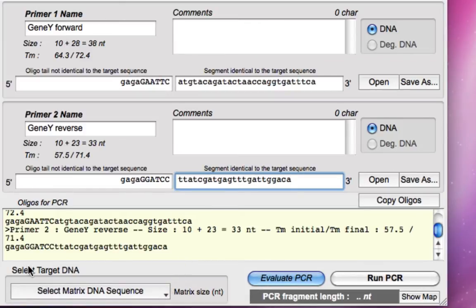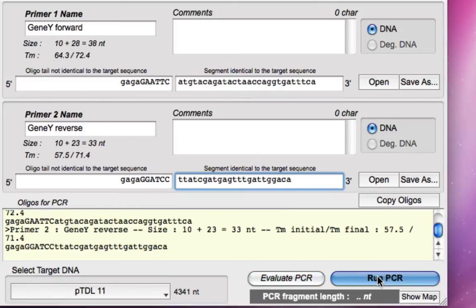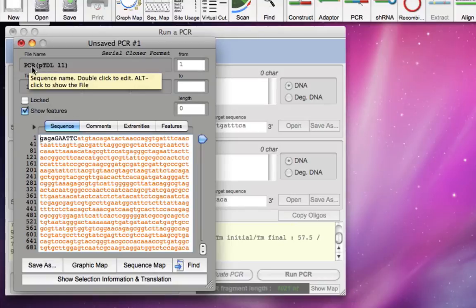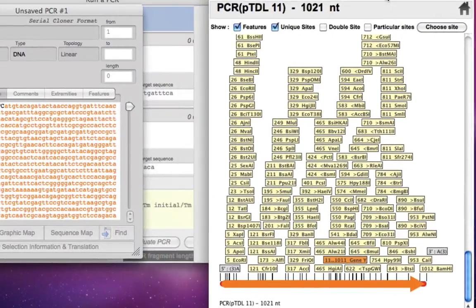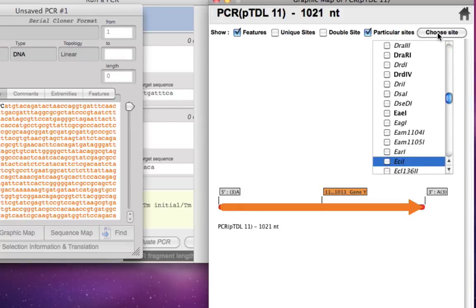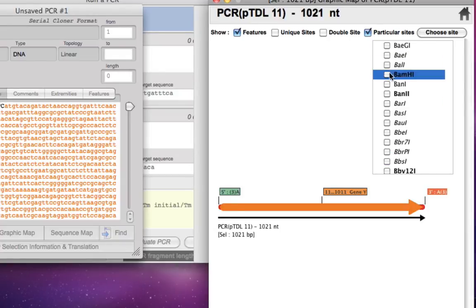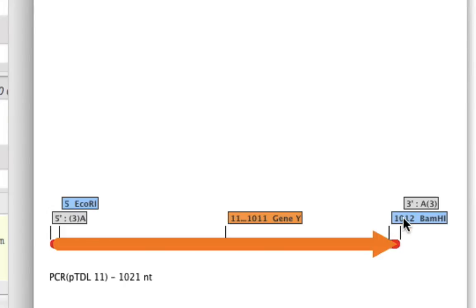Now we'll select the target sequence — the target DNA was the TDL11 plasmid — which we want to use for our PCR amplification. We run the PCR, and this is probably the fastest PCR you ever did. Here is the PCR amplicon we got. Let's look at the graphic map — I'll remove all the unique sites so it's cleaner. This shows gene Y with a little flanking region. Let's confirm we have ECO R1 and BAMH1 flanking our PCR product by going to particular sites and selecting ECO R1 and BAMH1. Here we go — we do have both sites, so we did our PCR correctly and retained both flanking restriction sites.